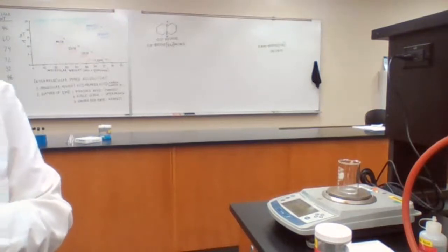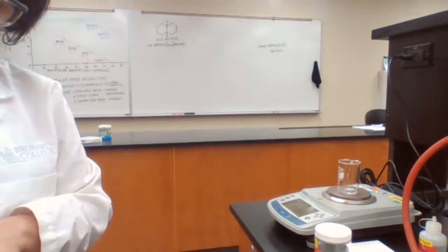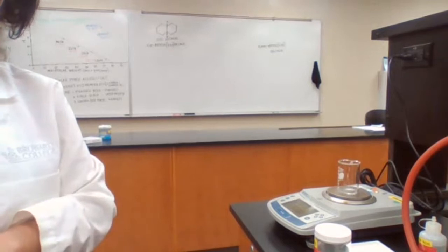We are going to take the evaporating dish to the fume hood, where we add water and the acetic acid.